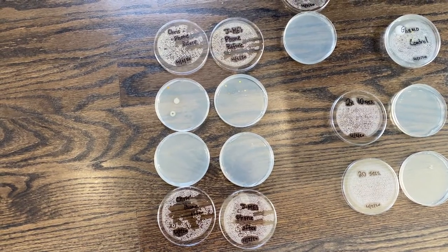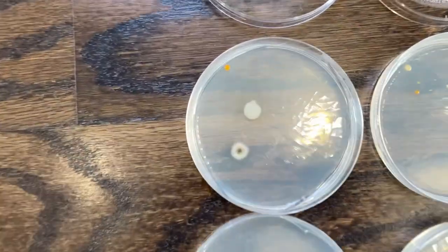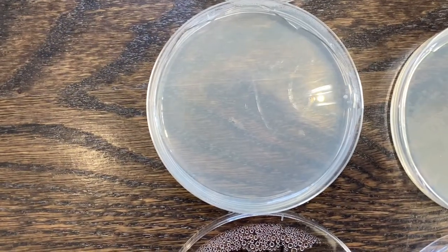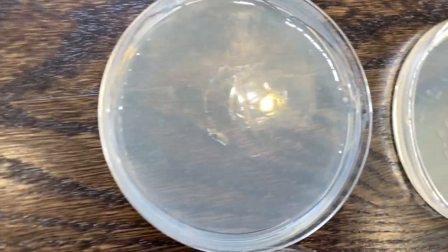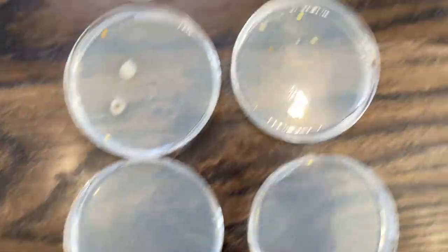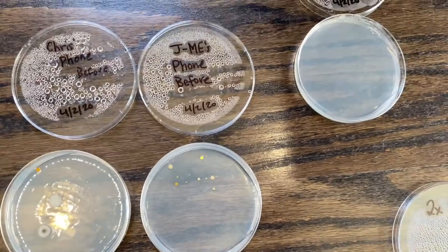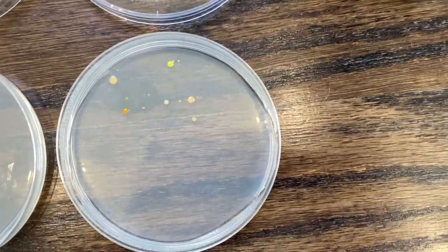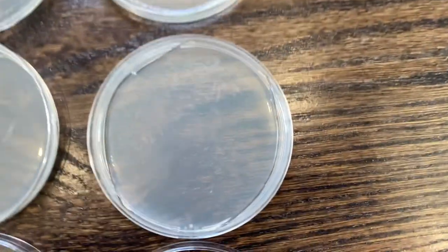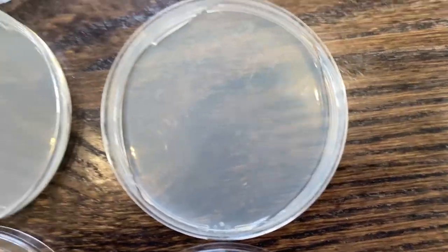Here we are — this is six days later on April 8th. Let's take a look and see what we grew. My boyfriend's phone before and after: clearly there's some stuff on it before, and nothing after PhoneSoap. And my phone — gross little spots, I don't know what those are but they're gross. Nothing after PhoneSoap. Thank god.